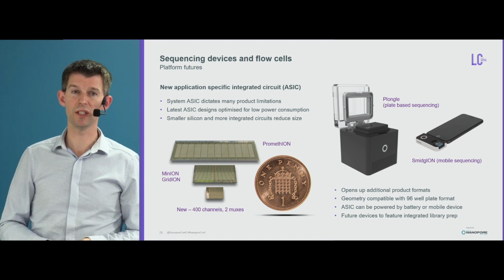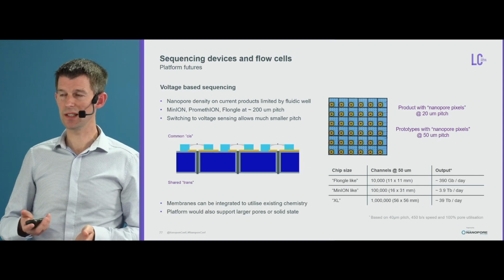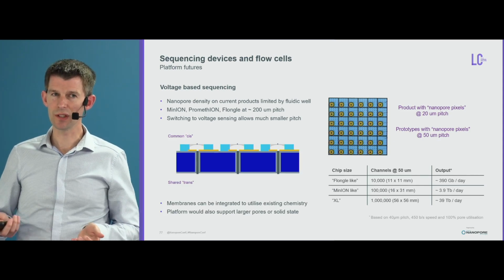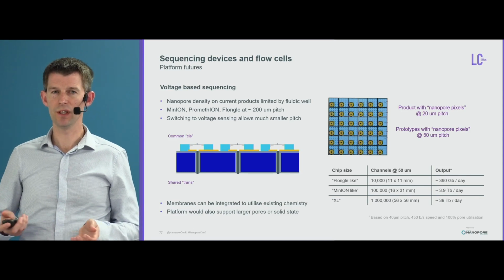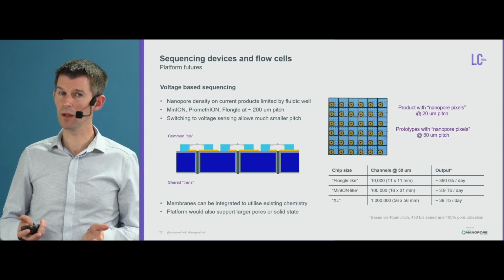Again, watch this space. One of the key limitations, as I said, was the well, and what limits the number of wells that you can get. Sorry, the number of channels you can get packed into a device is the size of that well.